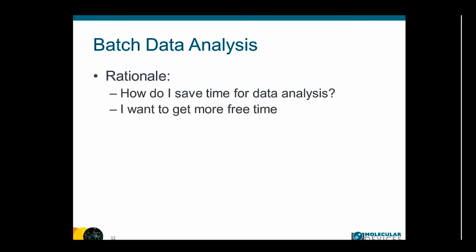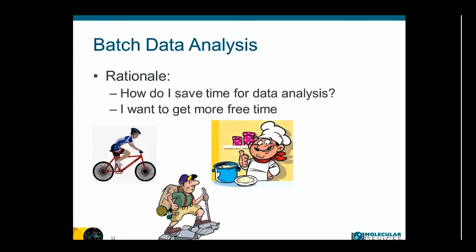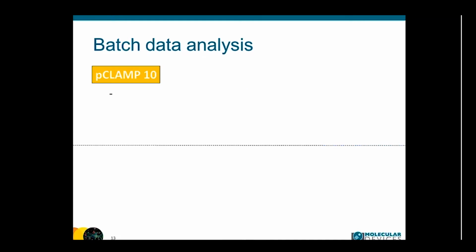And I want to get more free time, for what? I want to do more biking, or hiking, or cooking, or do more experiments. I believe that will be the last choice that you want to do, right? That's why we have the batch data analysis.